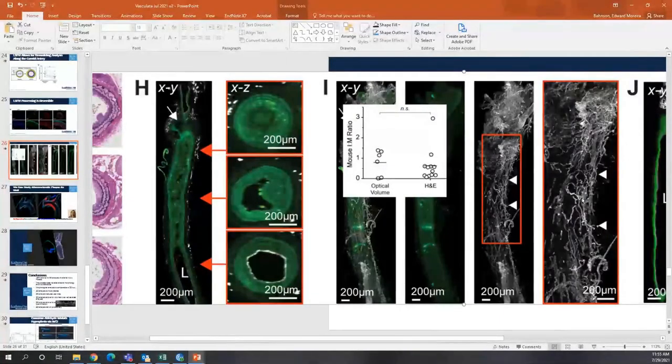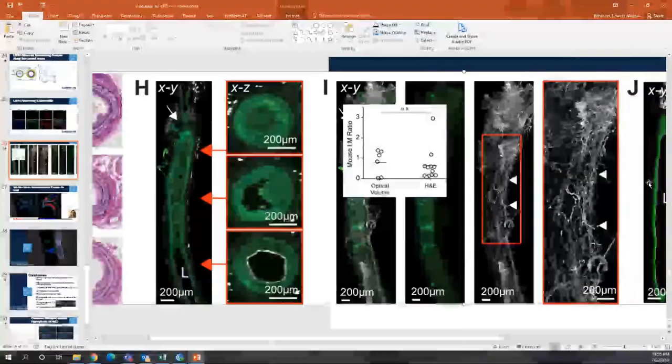So you see these capillaries are tiny. We are hoping to image a mouse leg next month in August to see actual collateral circulation in mouse. But I hope that this image here is very clear that we can see capillaries clearly stained with CD31, no problem.